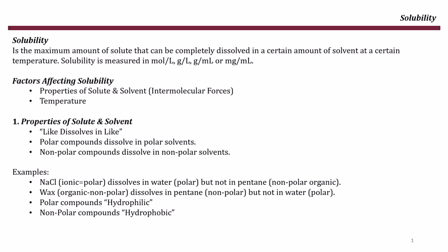The second factor is temperature. As temperature increases, molecules move faster, collisions increase, and intermolecular forces are broken more easily, which increases solubility. A common mistake is to add too much solvent while heating. If the solution is too dilute, no crystals will form when it cools.